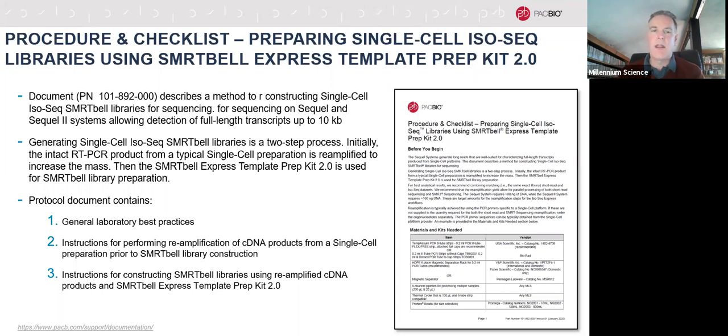But if you pull out of the 10x Genomics workflow, for example, before the fragmentation step, you've got the full-length cDNA that's individually barcoded to be part of a single cell, so you know all the transcripts together from a single cell. You can then put that onto the PacBio pipeline and sequence full-length cDNA.